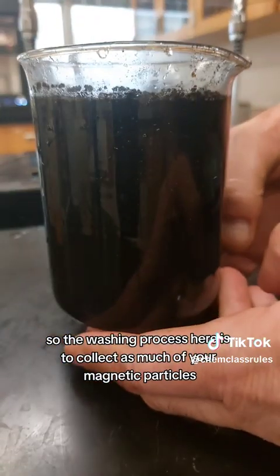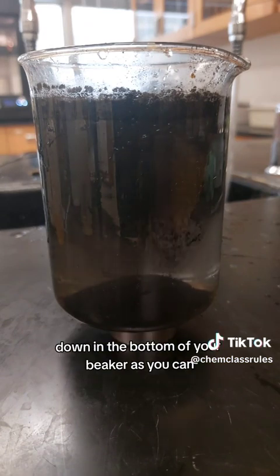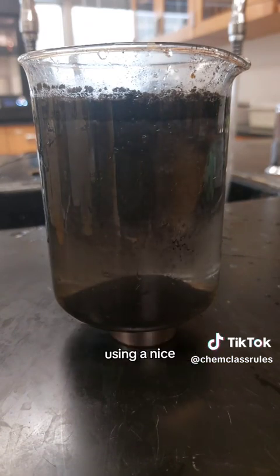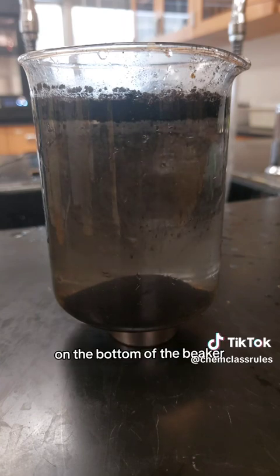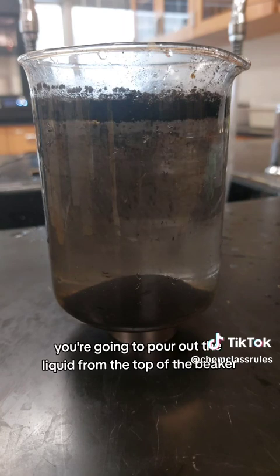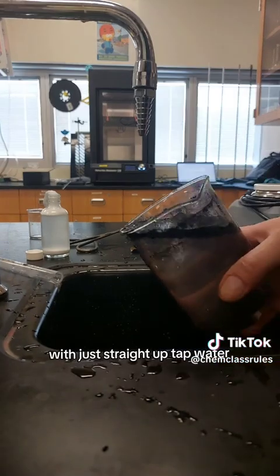The washing process is to collect as much of your magnetic particles down in the bottom of your beaker as you can using a nice powerful magnet. Once a good amount of those particles have collected on the bottom, you're going to pour out the liquid from the top and wash the remaining solid several times with straight tap water.